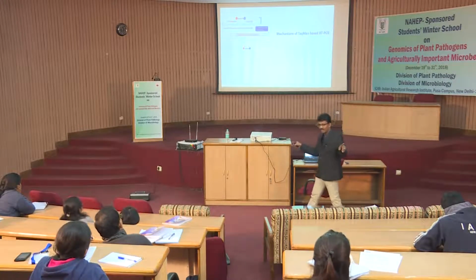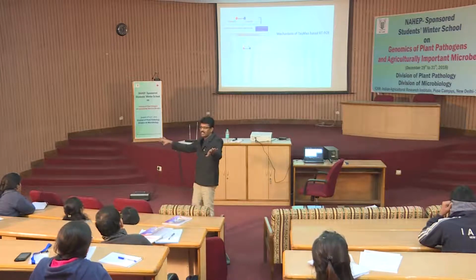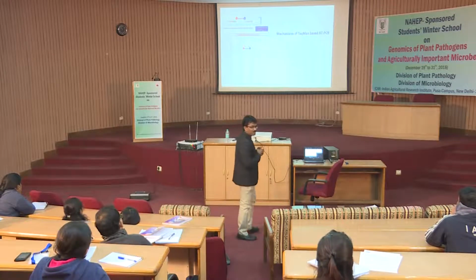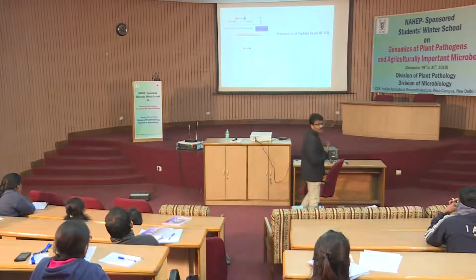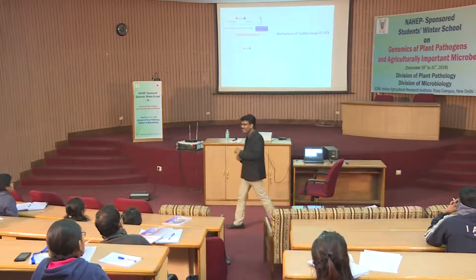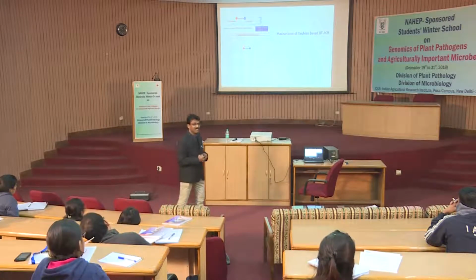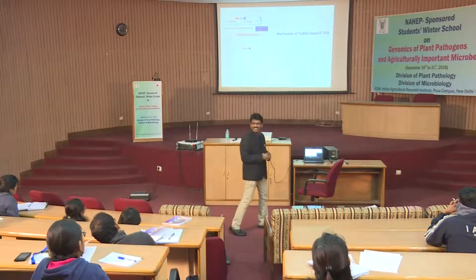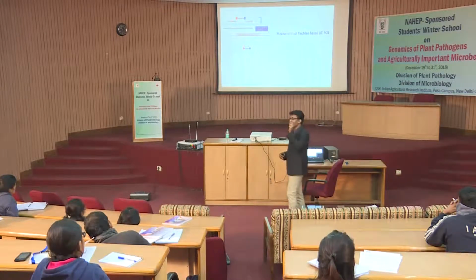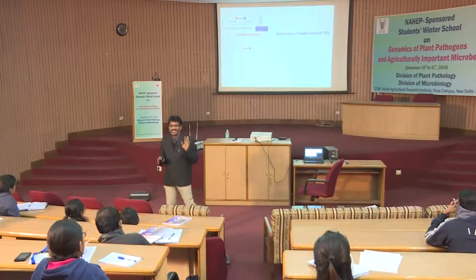Denaturation. Double stranded DNA will become 2 single stranded DNA. Correct? Now, what happens? Usually, primer will go and bind. But here, primer also will go and bind. Parallelly, the probe also will go and bind. Is it clear? This you should understand.